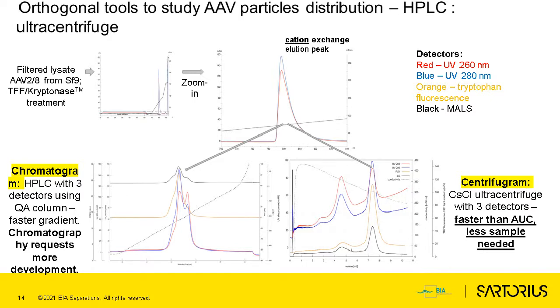If you just inject the sample on the column, you usually would not immediately see the separation; as you can see here on the left, the full and the empty are quite together. Only with improvement of the buffers, the pH, and so on, can you get better separation, or maybe you even need to go to another ligand.